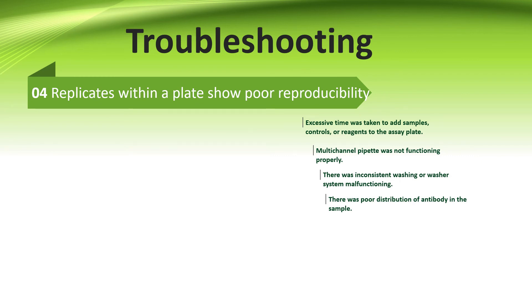And the last scenario for troubleshooting is when the replicates within the plate show poor reproducibility. The reasons could be: first, excessive time was taken to add samples, controls, or reagents to the assay plate. Second, if you are using multichannel pipettes, they were not functioning properly. Third, there was inconsistent washing or poor washer performance. Fourth, there was poor distribution of antibody in the sample.